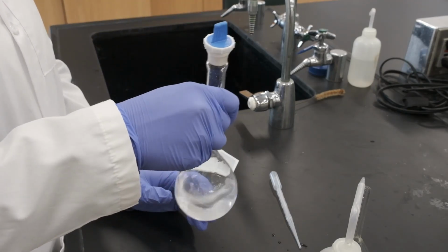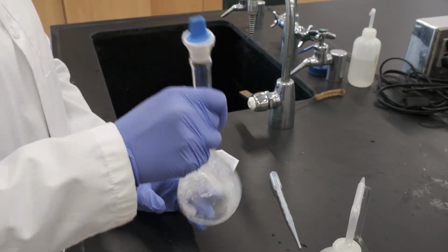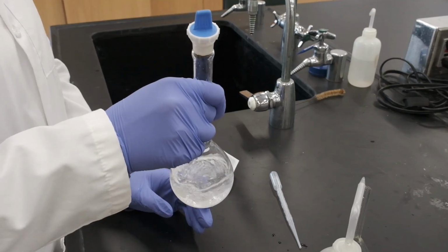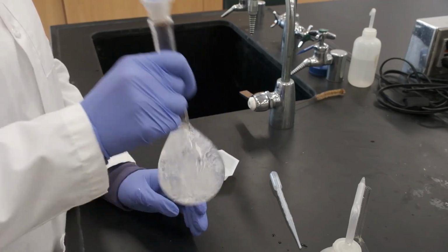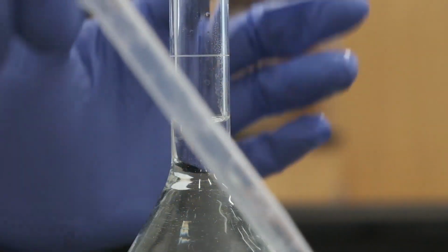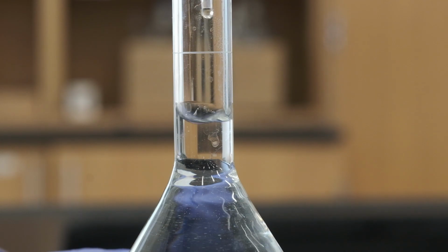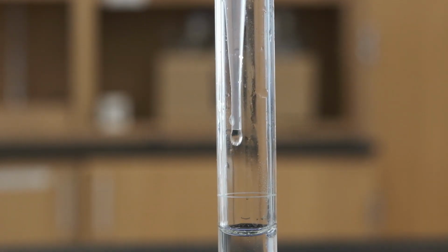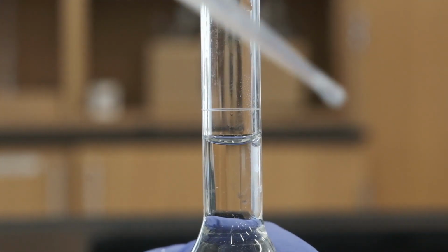Once the solution is completely dissolved, we add the water to the meniscus, first with the wash bottle, and then for the last few drops to reach the meniscus with the plastic pipette. At this point, when it's close to the line, we're going to use a pipette to get it really there. So you want to keep it at eye level.